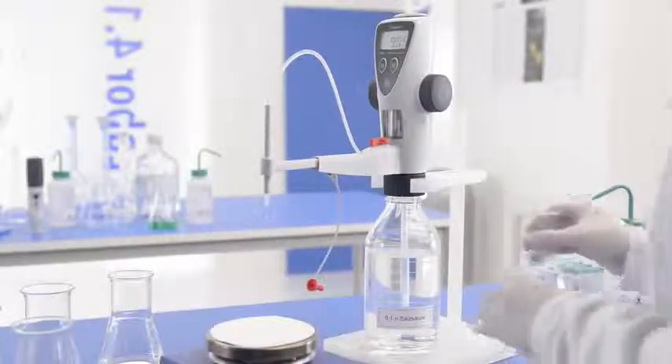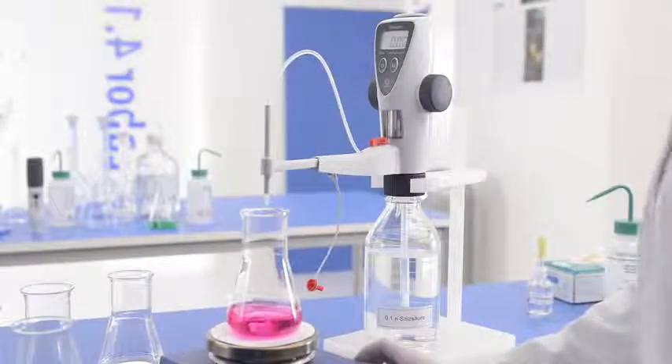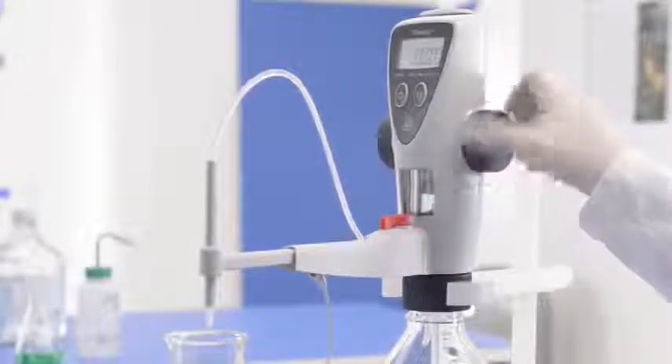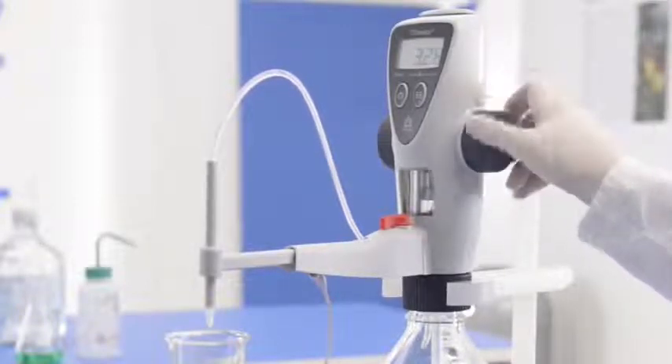Before starting the next titration, set the display back to zero using Clear. To refill the Titrate again, move the piston upwards until it stops. You are now ready to start the next titration.